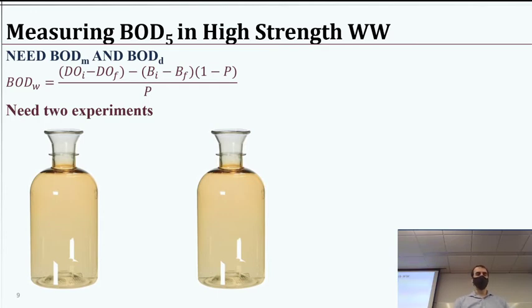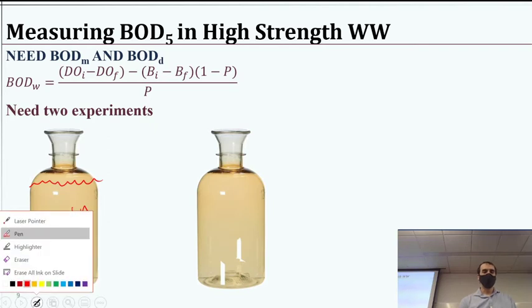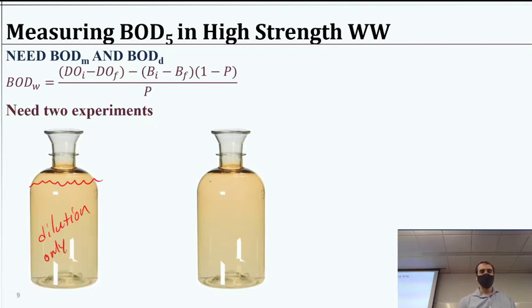So every time you do these seeded BOD tests, you actually have one that is just the dilution. We have that experiment where we're just measuring what's happening in our bottle for the dilution water. And then this other one where we have the mixture, and we're making measurements on that one.